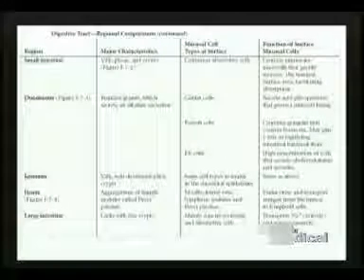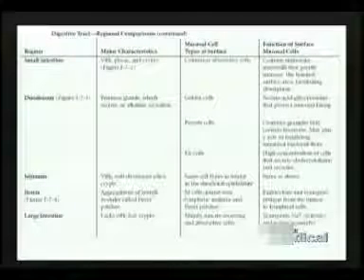The jejunum is also characterized by the prominent villi, crypts of Lieberkühn, and so on. But the ileum can be distinguished from the jejunum by the presence of the patches of lymphatic tissue in the form of Peyer's patch nodules immediately adjacent to the luminal surface epithelium. Down in the crypts of Lieberkühn, in all parts of the small and large intestine, are the Paneth cells. Their job is to produce lysozyme, which has a bacterial regulating role.